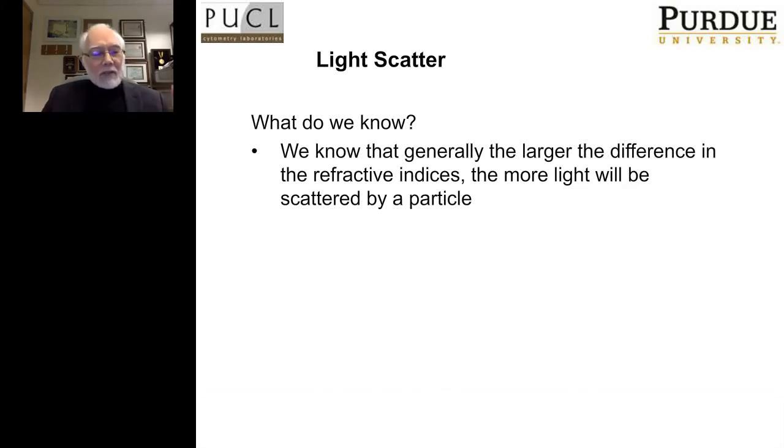And let's ask ourselves a couple of questions about side scatter. What do we know about side scatter? So some very basics: we know that in general terms, the larger the difference in refractive index, the more light will be scattered by a particle.